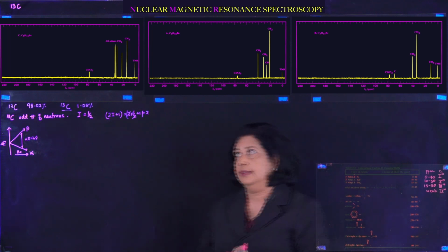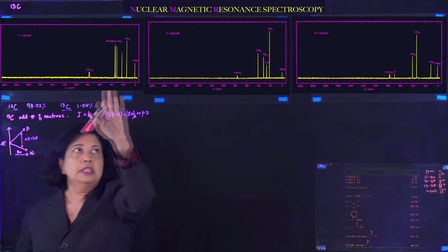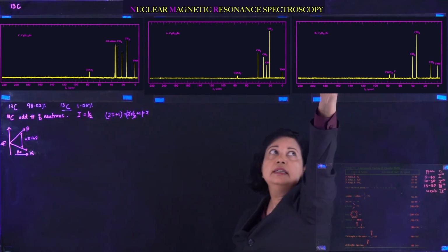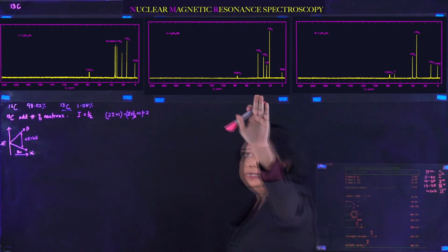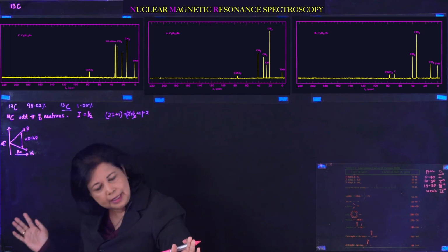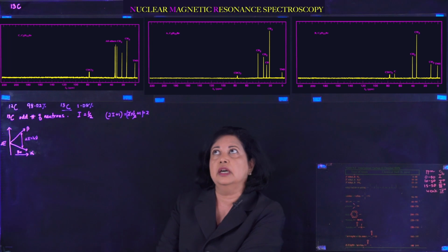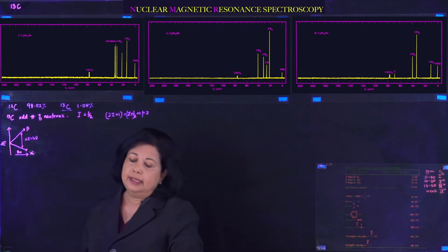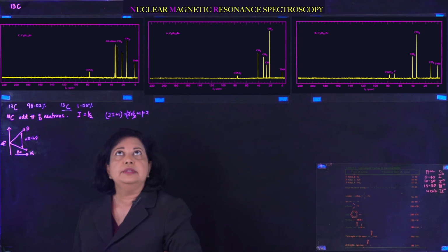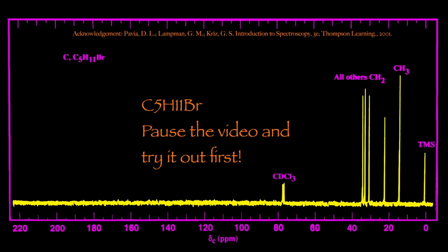It's a huge field. All right, let's look at these 3 spectra. All of them have the same formula, but different 13 carbon graphs, which would make them isomers for 5 carbon. We're going to figure out what those are just by using a 13 carbon NMR without using a proton or an infrared or even a mass.